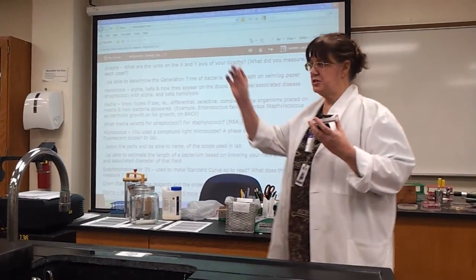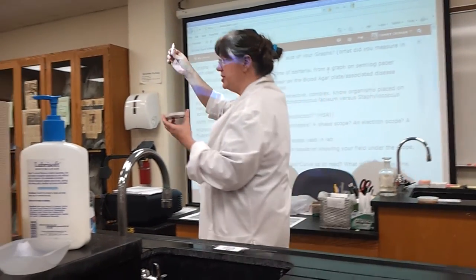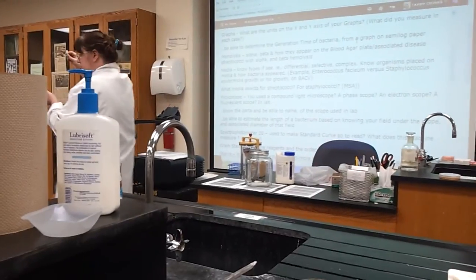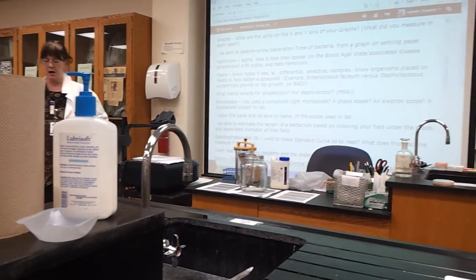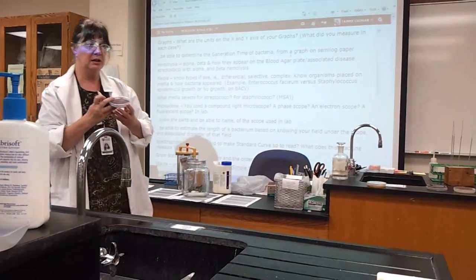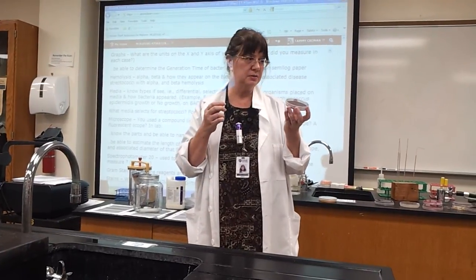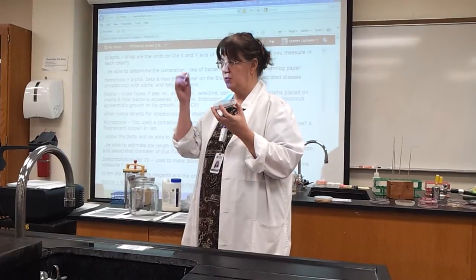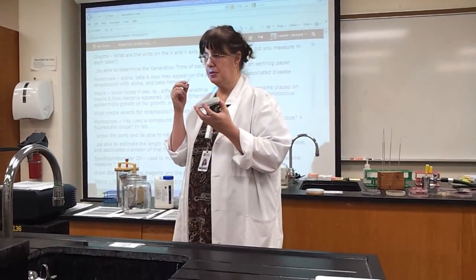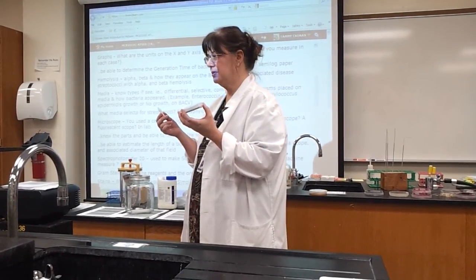The oxidase test. Do you remember this? That was the tube I broke to put the enzymes down to do the oxidase test right onto the chocolate agar. If the colonies turned black, it was the presence of non-pathogenic who? Neisseria. Non-pathogenic Neisseria, with the oxidase test. The oxidase test turns the colonies of non-pathogenic Neisseria black because it detects certain cytochromes.